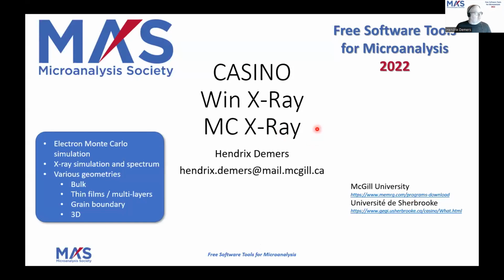So basically today I'm going to talk a little bit about these three programs. I'm going to do an overview of the capabilities of each program. And I will also give you a demonstration of Casino, which is something that is more useful for the community.